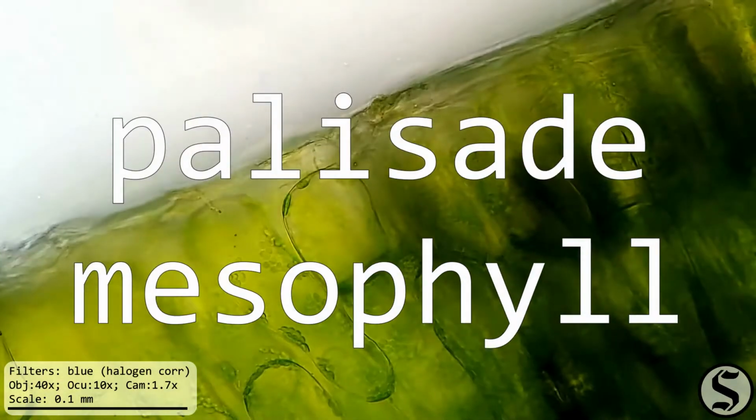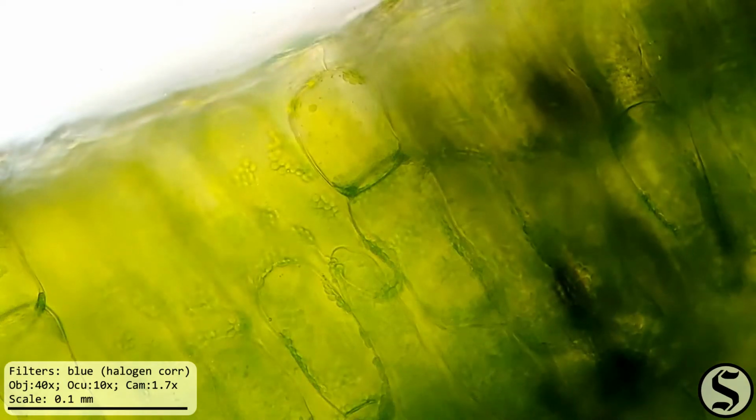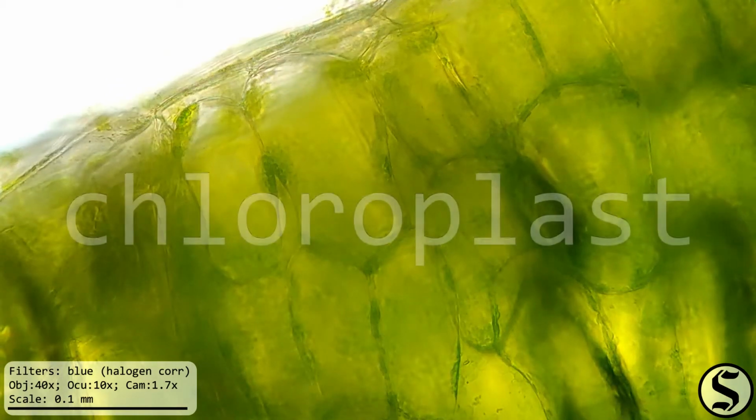We are now in the palisade mesophyll. Palisade is from the Latin palus for stake, a series of which makes a fence. And that's why it's called that. It kind of looks like a palisade fence. And the palisade mesophyll goes on the top of the leaf, and the cells are arranged that way to be very tightly packed so they can get the most light to the most chloroplasts.